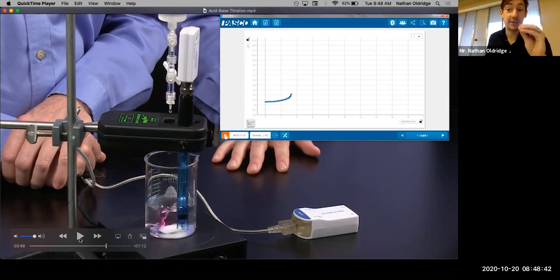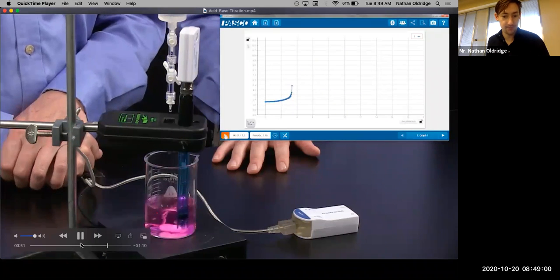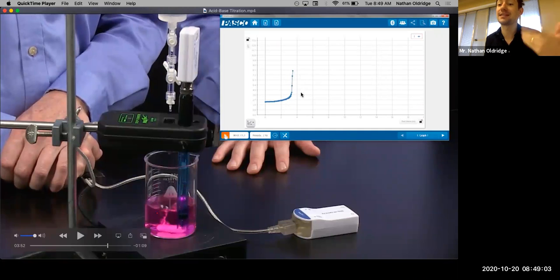Your job as a chemist when you're doing a titration is to finish it off and stop right when it turns the faintest amount of pink that actually stays. Because the faintest amount of pink means you have the tiniest amount of base left over from that one extra drop. Okay, he's gone overboard because he has logging software that can just do all those calculations for him. But as soon as you see that it is faint pink and it stays that way for like 30 seconds, you can be assured that you're at or near the equivalence point.